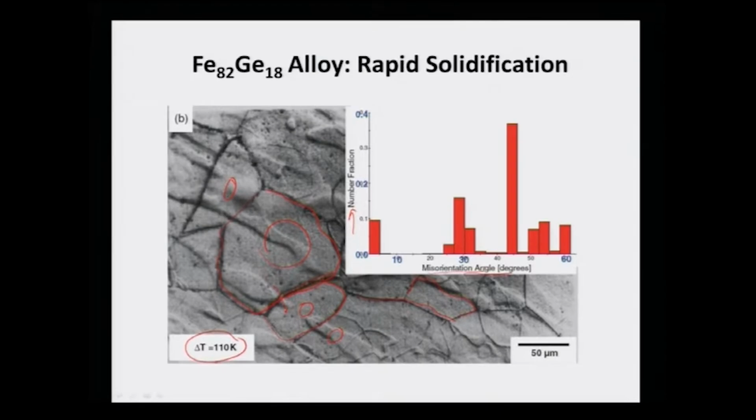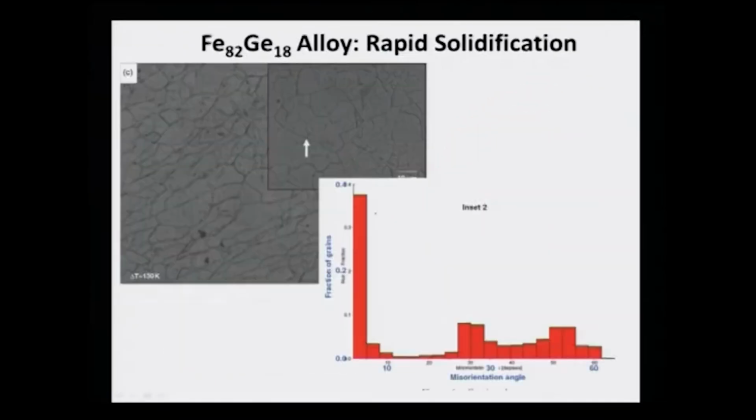So, this data is directly obtained from EBSD after just collecting the EBSD information and plotted as a number fraction of grains versus misorientation angle. As you see, most of the grains actually have a misorientation angle of more than 25 degrees, and a very small amount has less than 5 degrees. So, most of the grain boundaries here are high angle grain boundaries, that is very clear. Therefore, one can obtain the nature of the grain boundaries from the EBSD analysis directly.